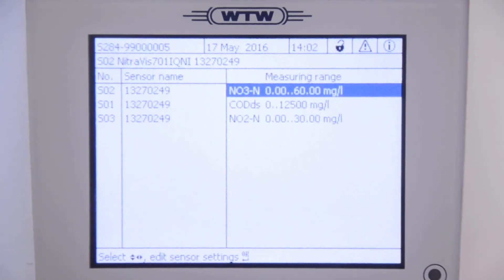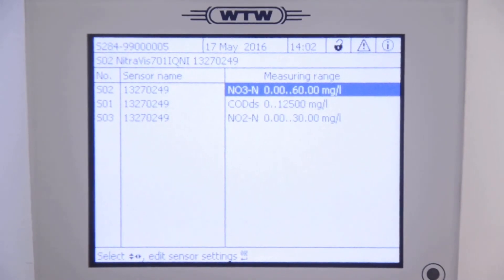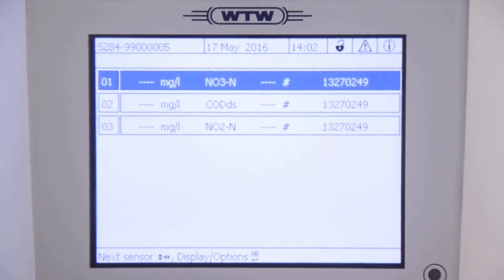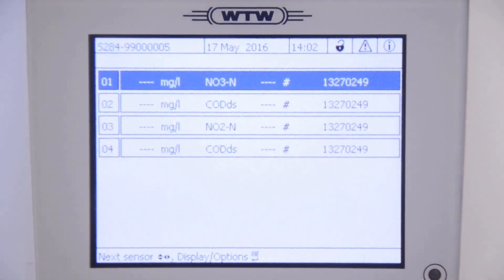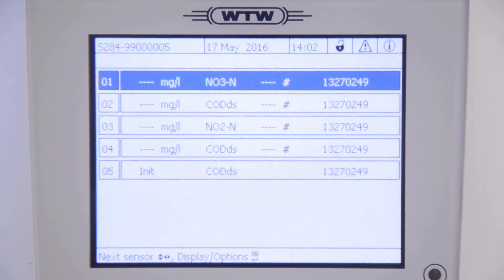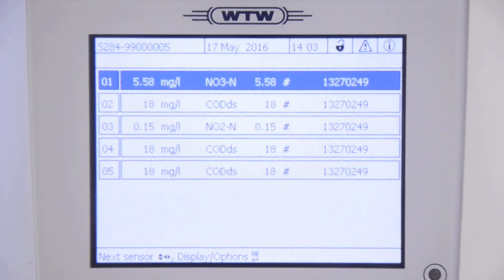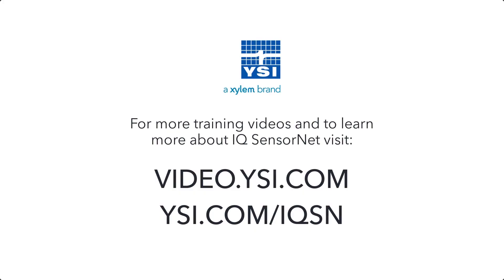Now you will have three carbon parameters on the measuring screen, which you can change to any of the other carbon parameters in the settings, including BOD, TOC, UVT254, and more. For more information, please visit us at ysi.com/IQSN.